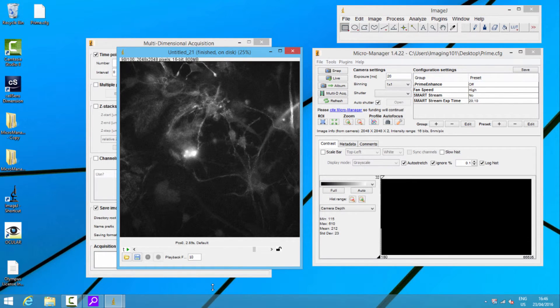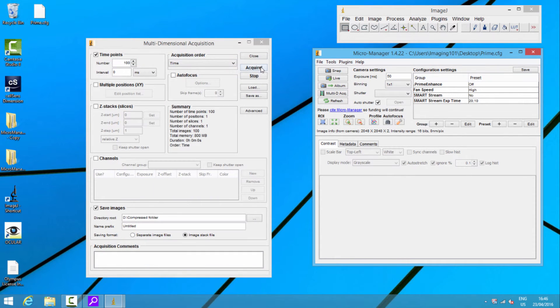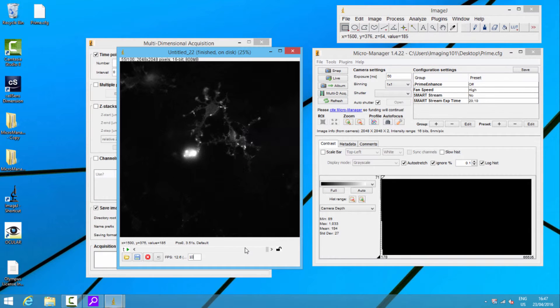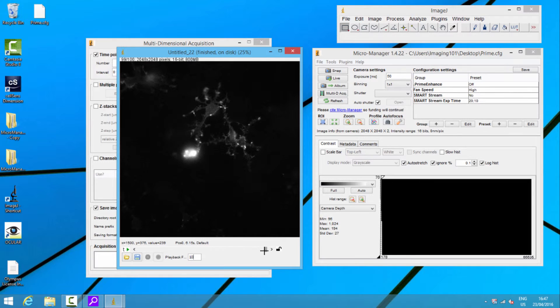So really good high-speed triggering. Now let's try 50 milliseconds — we have 33 frames a second at 20 milliseconds, that's pretty good. Two frames a second is about what you'd get from a USB device. So now controlling it with 50-millisecond exposure time — it's just capturing them and writing them into the buffer. When we look at this, we have the red and green going through sequentially — a little bit slower at 50 milliseconds.